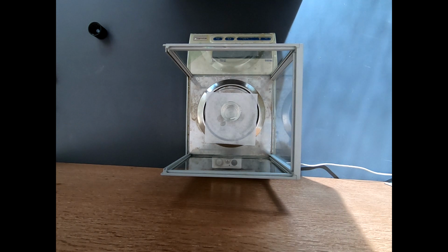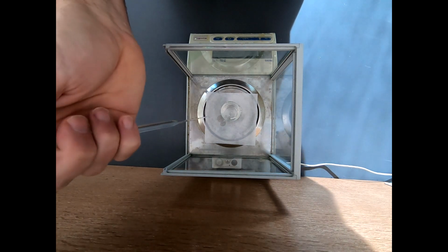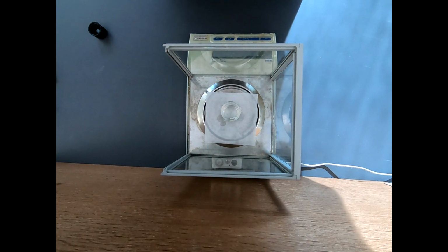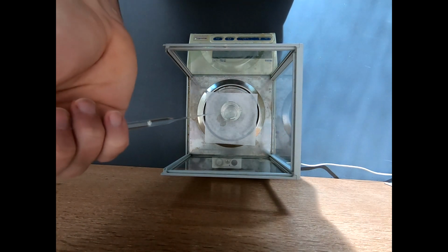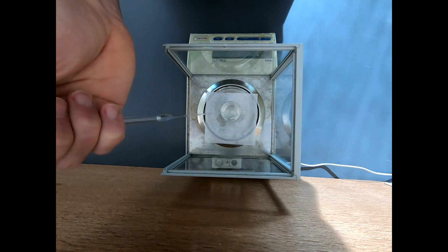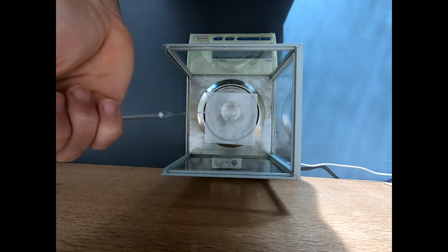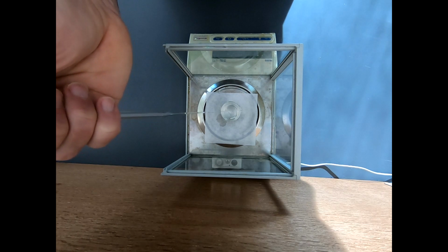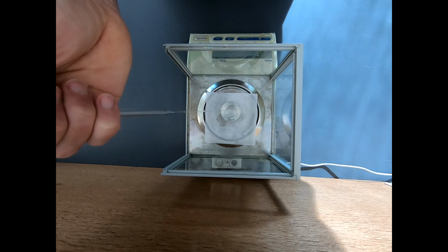It's okay. I know that I need to put something on the balance when I do this because a stray drop here or there happens. Now, this is enough that I could actually measure this out as a volume, but it's just so much quicker and easier to weigh this out on the balance that I can't let go of the simplicity of doing it this way. Okay, I don't know why I'm going so slowly. That's about 6.2, 6.3. See, 6.48, 49. One drop will do it.